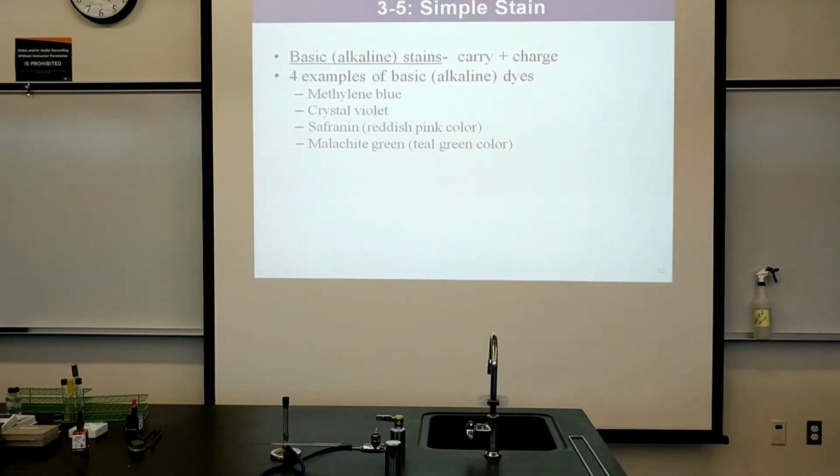A stain, let's give it a color. So I'll change my pen to red or some color. How's that? Make a stain molecule here. And this stain, or chromogen, gen means to give birth to, and chromo means color. This, change colors back, is going to be absorbed by the cell.